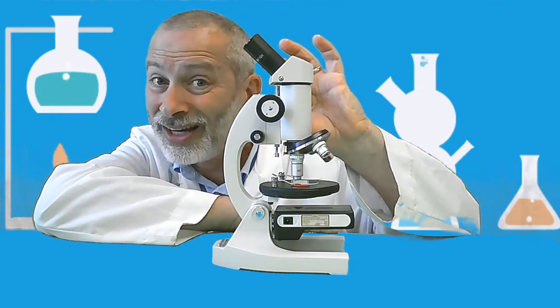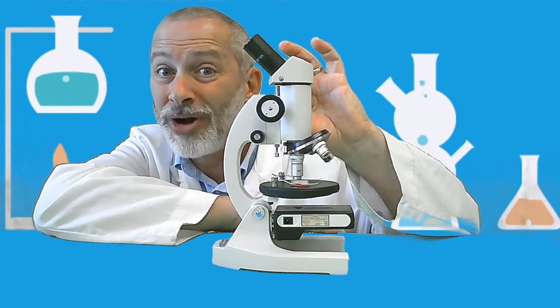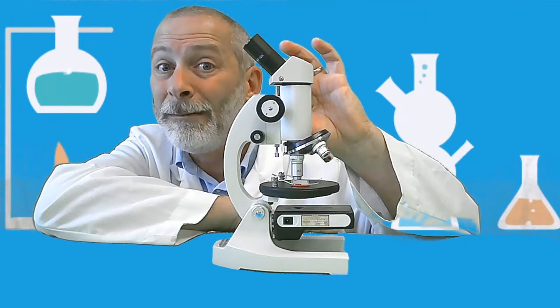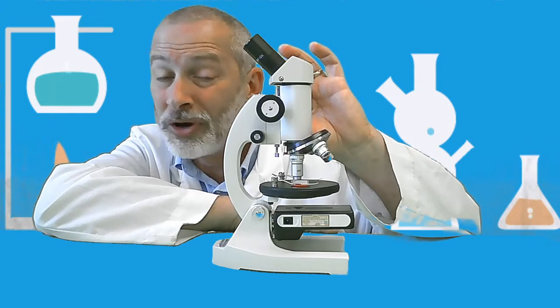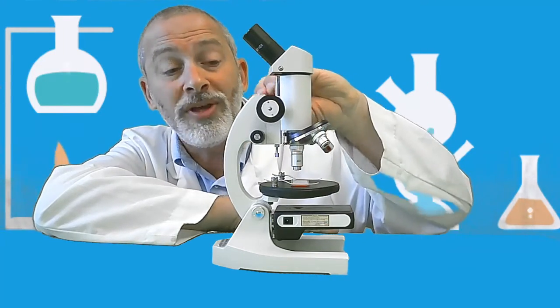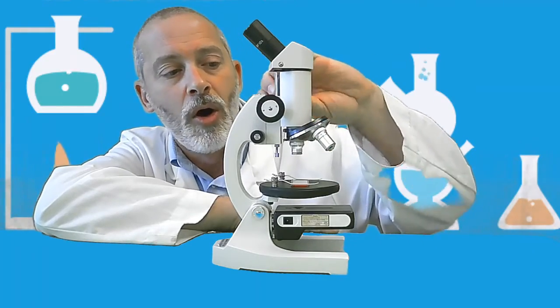However, if you have the high power objective lens pointing down and you lower the coarse adjustment knob, I'm not going to do it, but that coarse adjustment knob could be turned right in through the slide. And if you're working with a glass slide, that means shattered glass all over and a broken objective lens. And that's the most expensive part of a microscope. So you always start using your microscope with low power all the way down.